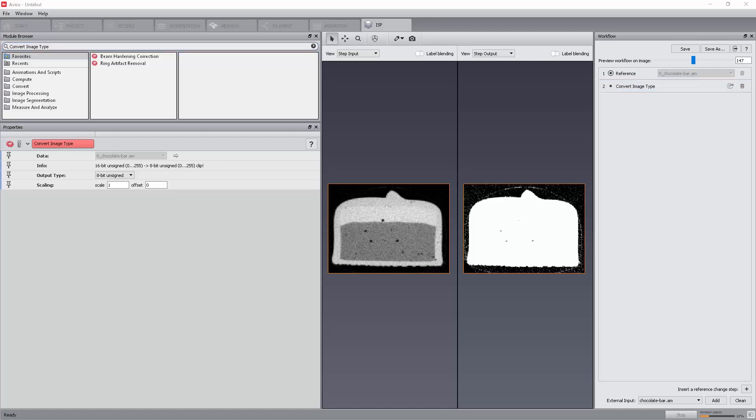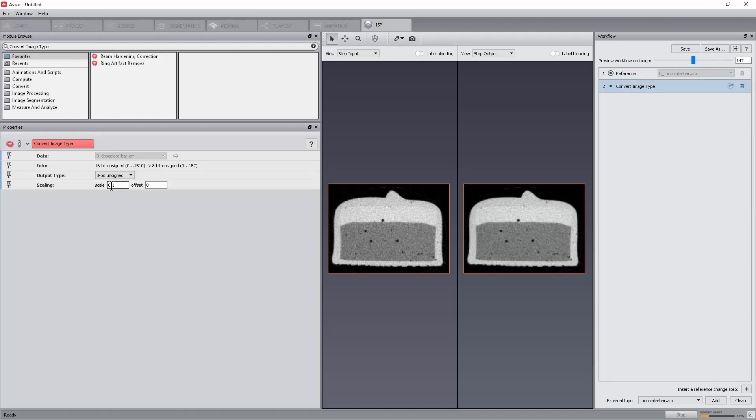At the same time, the module is automatically applied to the last output step, which is the original data reference data in this case. Its result is displayed in the right viewer. Change the scale port to 0.1. The right viewer is updated with the changes.